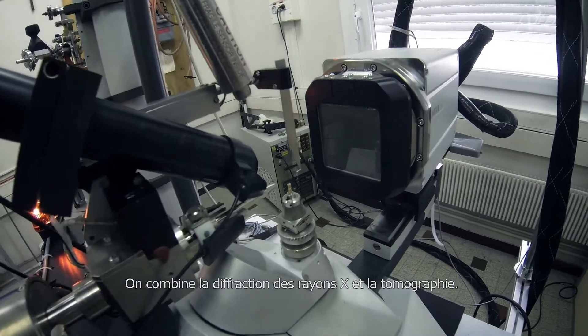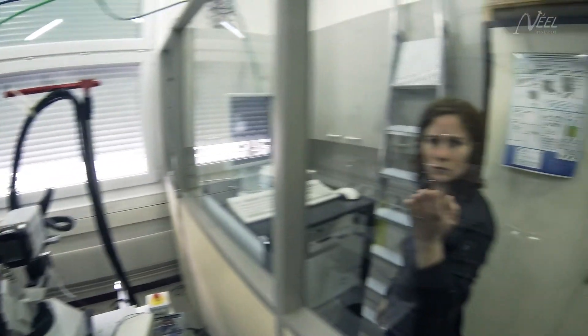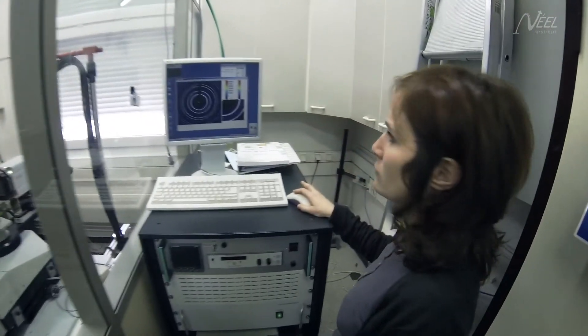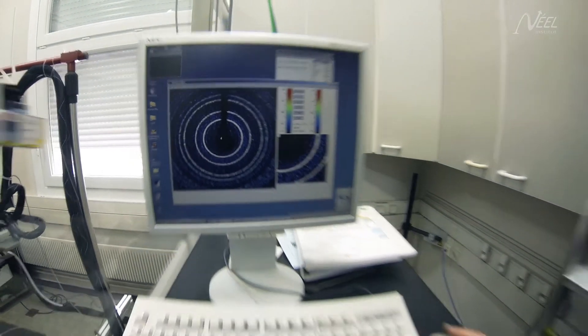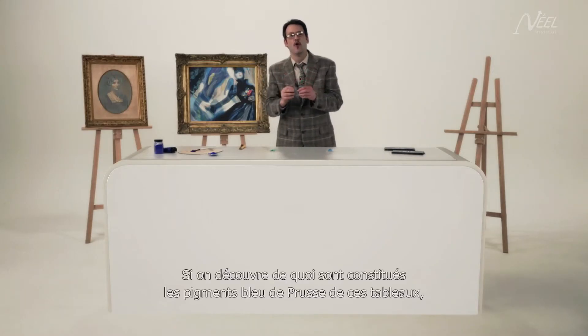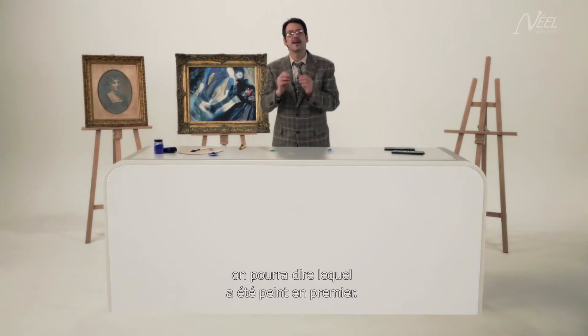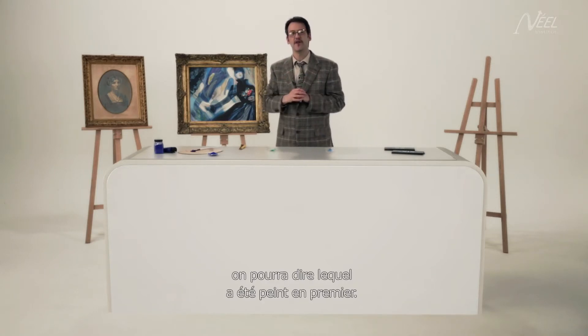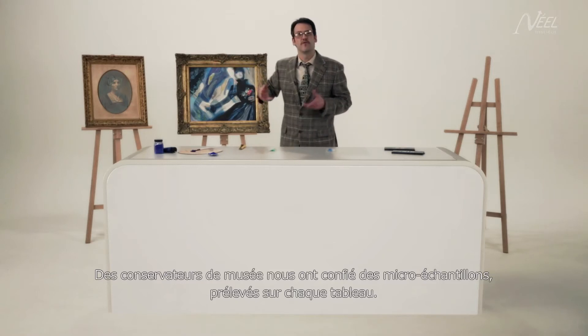X-ray diffraction is combined with tomography. Well, what we need now is a little explanation. If we can tell what the Prussian blue pigment used in these paintings is made of, then we can tell which one was painted first. Museum curators have provided us with micro-samples taken from each painting.